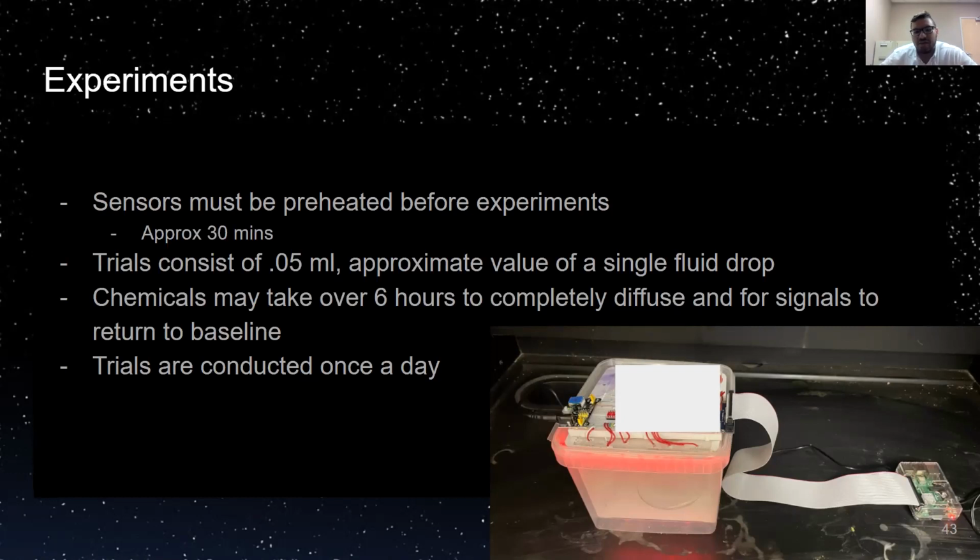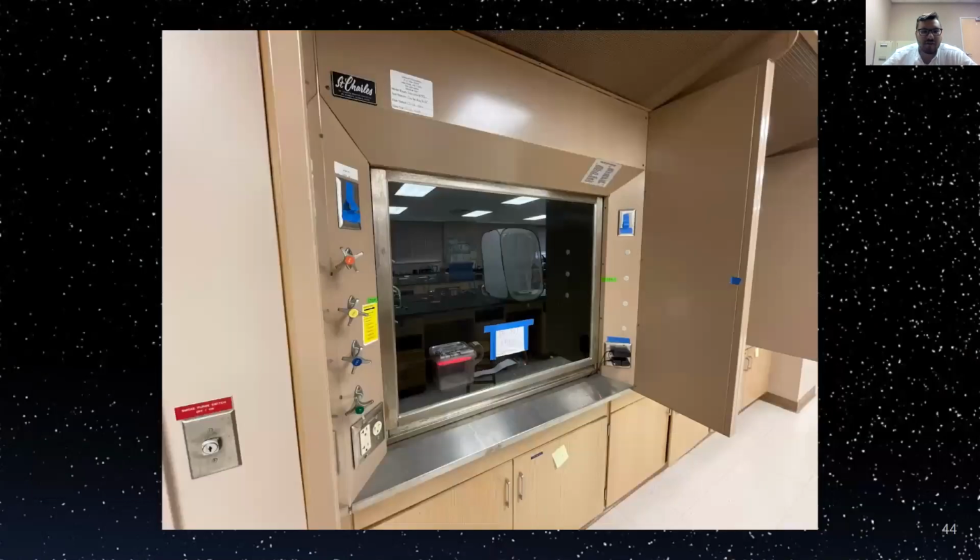And trials are generally conducted once a day, just to make sure there's no accumulation or cumulative chemical response inside of our sensors. So this fume hood is closed. We're not dealing with anything toxic or detrimental to human health. So it's closed primarily to make sure that it's isolated. We don't have any adverse interactions.